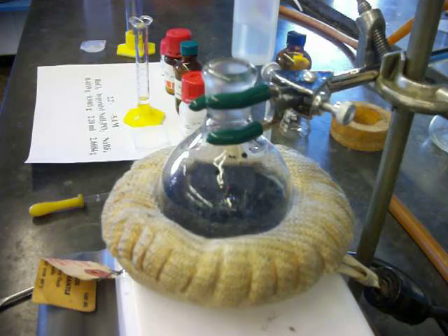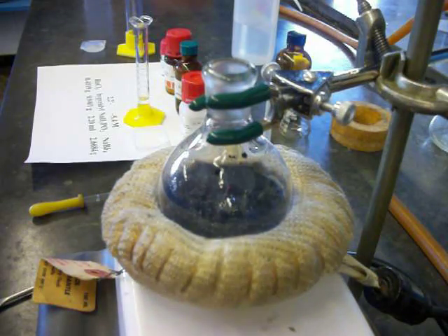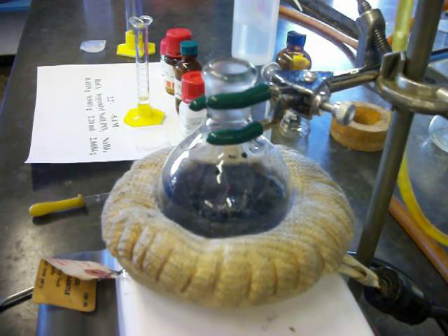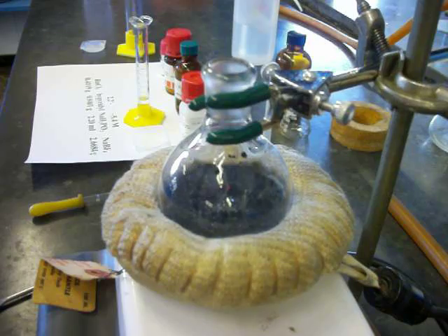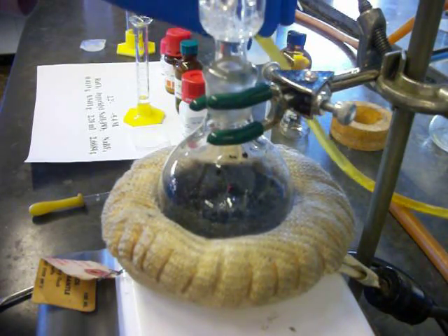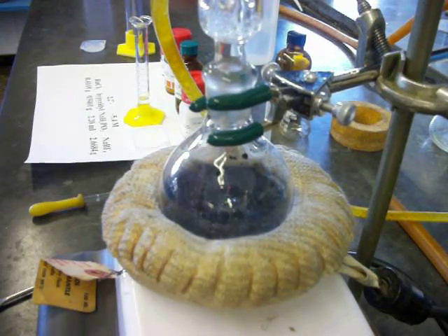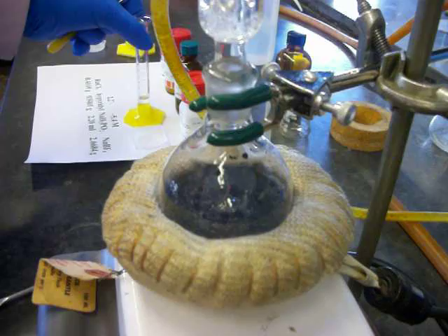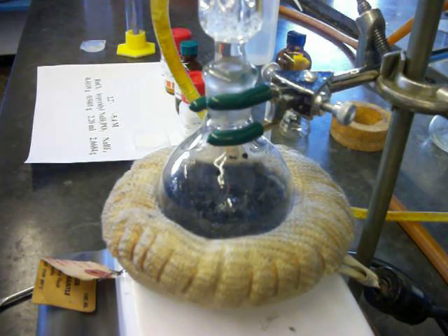We've got our ruthenium and bipyridyl in there. I'm going to put the reflux condenser on. The next thing I'm going to do is add the hypophosphorus acid through the top of the reflux condenser. You can see that running in.